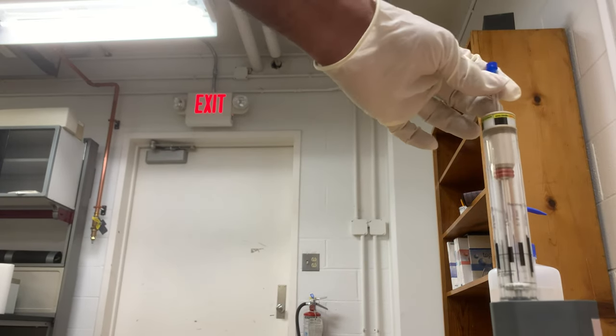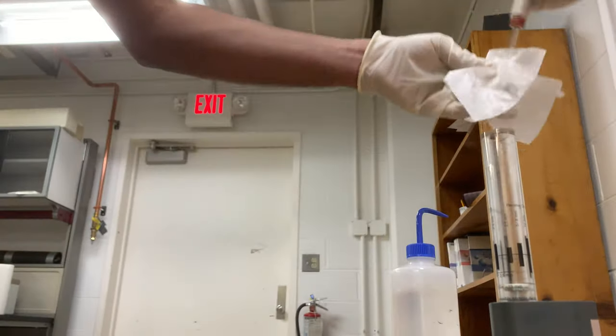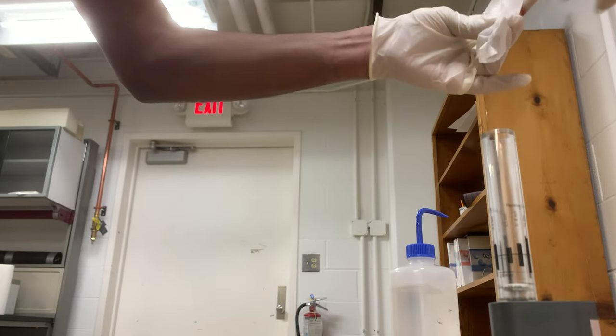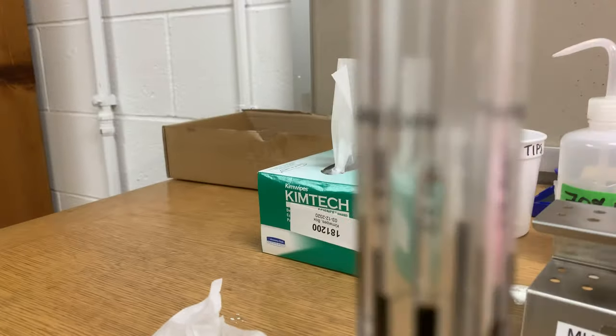Now my sample. Make sure there is nothing unwanted, and the sample should be at a certain level because of the NMR probe. So see the solvent layer.